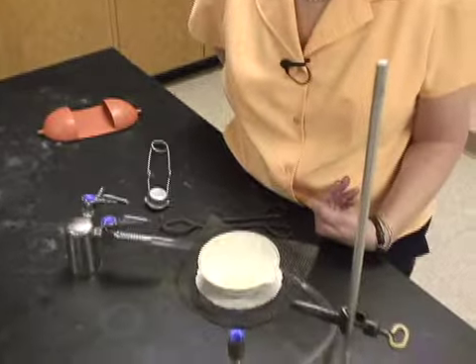Now, what are some other sources of error that we could have? Well, if we were measuring on the scale and we took it off when it was 1.99 and we expected that it was 2.00 and we recorded the 1.99 in the data table versus the 2.00, that would also create some errors in our results. The biggest errors, however, for this is not heating it long enough to drive off all of that water. That's primarily the big one that happens here.